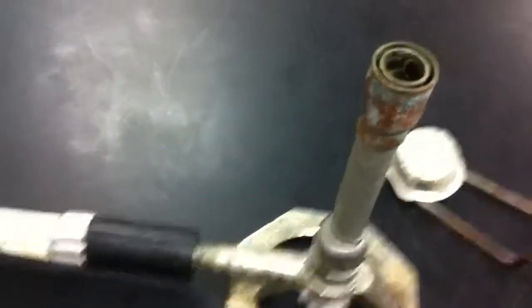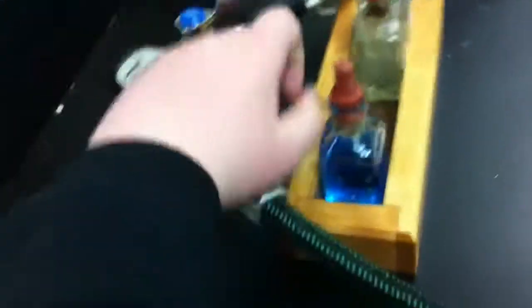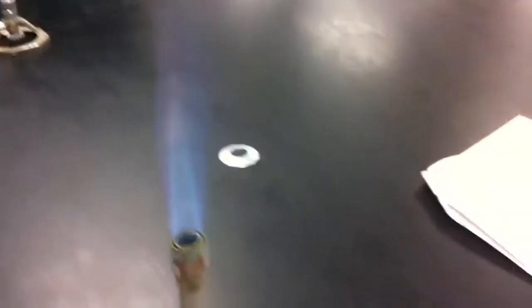So here's the Bunsen burner. I'm going to go turn it on. Alright, I got the Bunsen burner on. Trace, you have the apple juice. Strike it. Now put the Benedict solution in there.